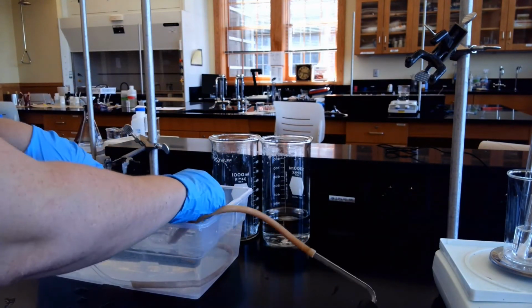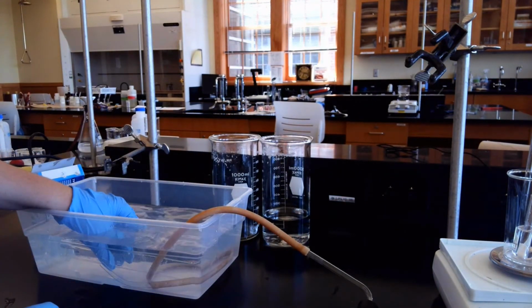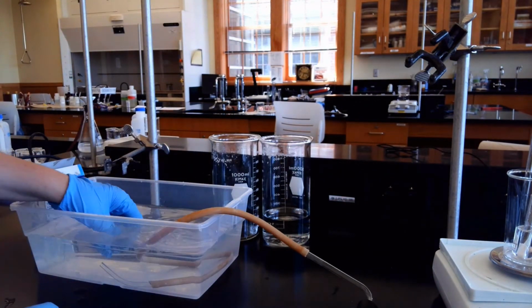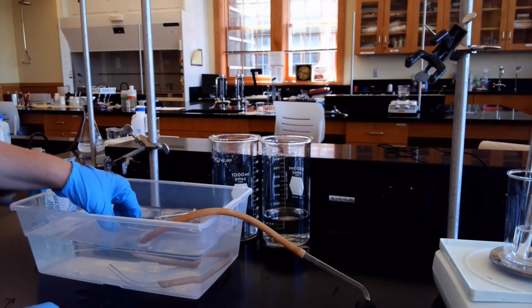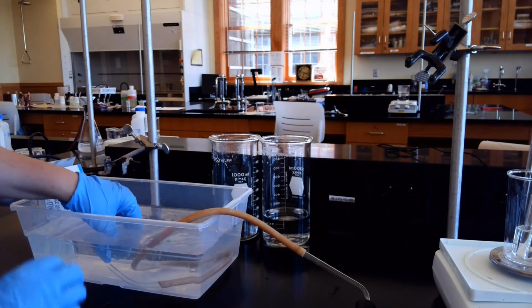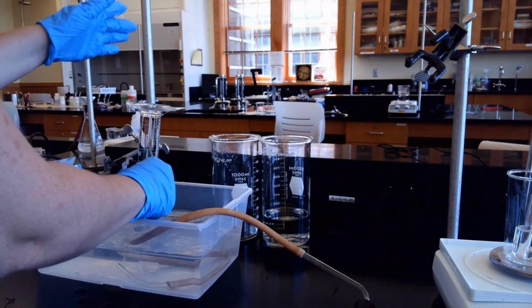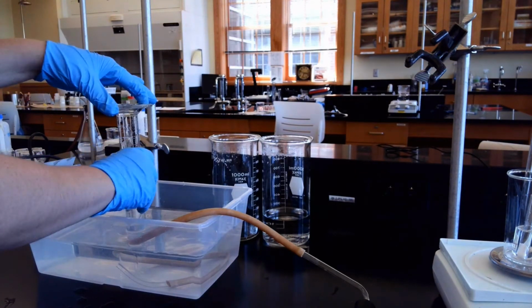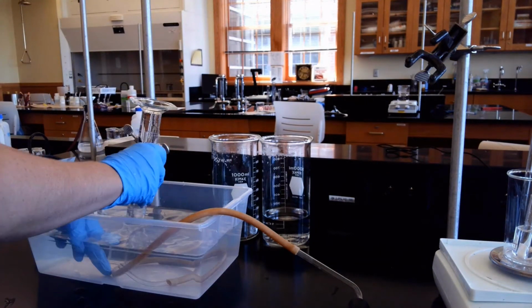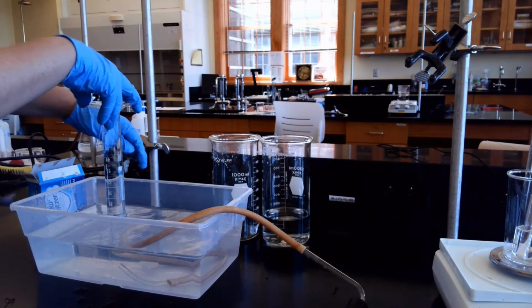So here we go. This is the fun part. We're going to submerge it as much as we can. And we're going to tilt it up so we get out the air. And, oh, we got some bubbles. And again, okay, so we should be bubble free now. So we're going to flip upside down. Look at that. No air bubbles. And we're going to move this on over to our clamp.